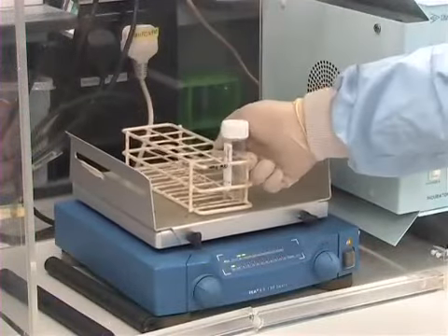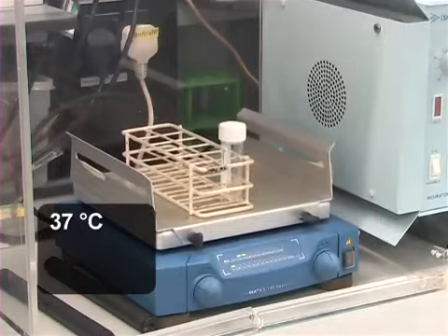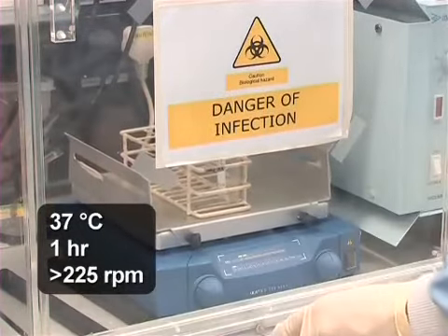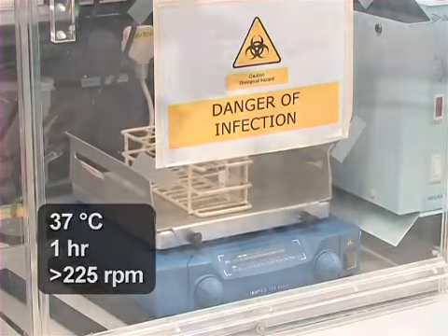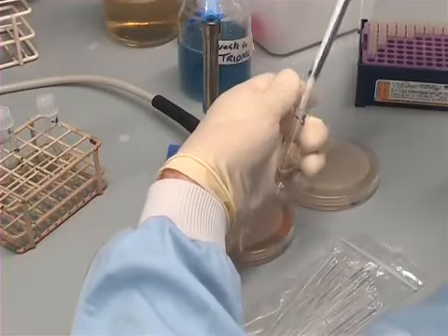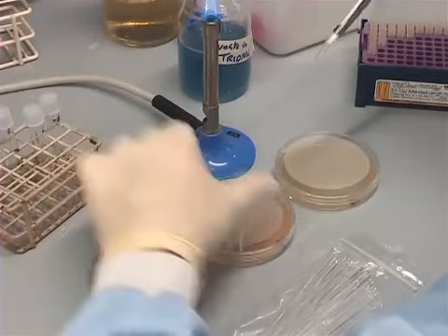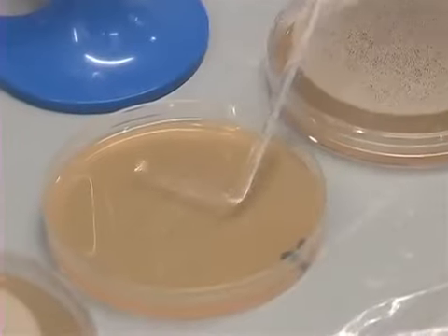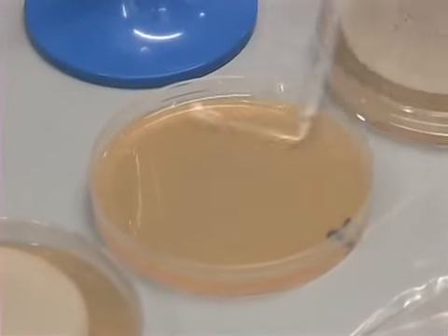Place it in a shaking incubator at 37 degrees Celsius for 1 hour at over 225 RPM so that the cells can recover. Using proper aseptic technique, add 20 to 200 microliters of bacteria to an LB agar plate and spread the medium around with a bacterial spreader.